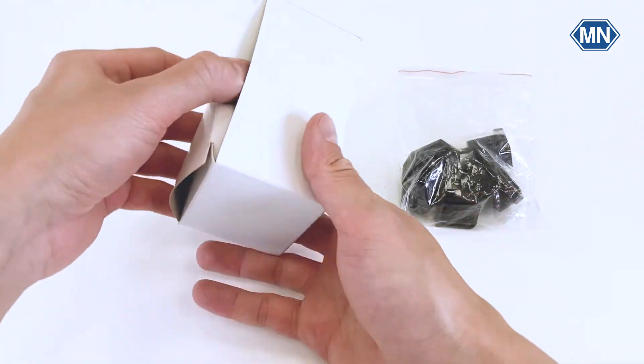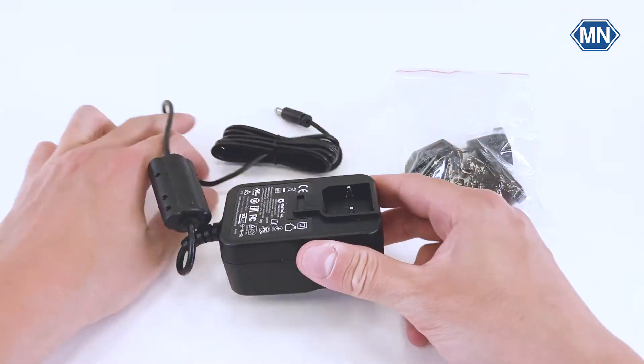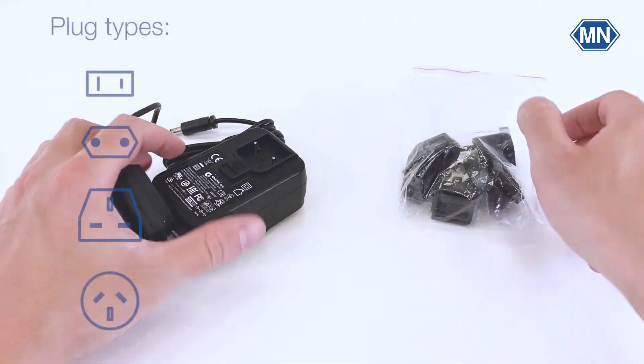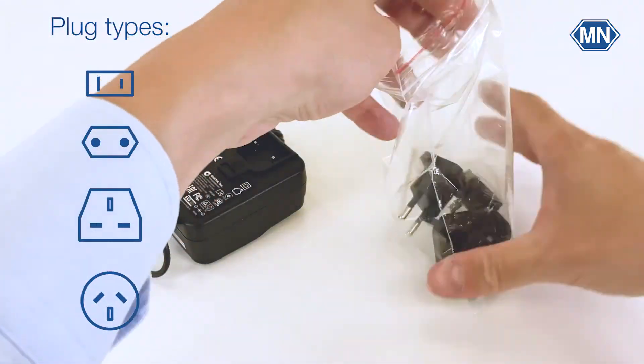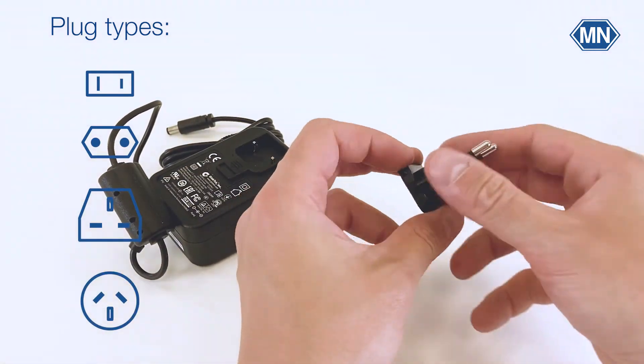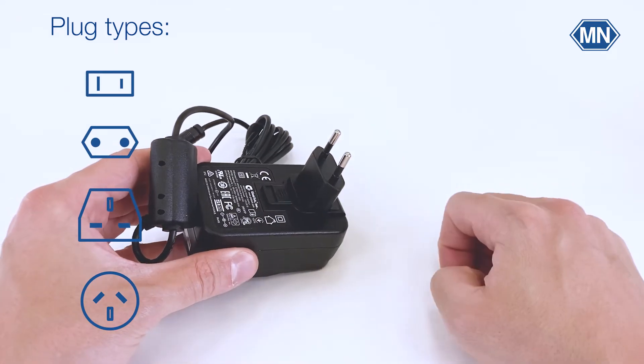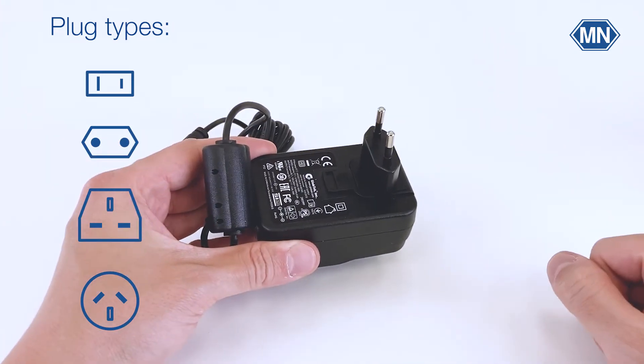The included power supply comes with four adapters for four different power outlets. Before you can use the power supply, take it out of the box and choose one of the four adapters that came with the reflection photometer. Choose the type that corresponds to your power outlet, for example in your lab, and slide it in like this. And once you hear a click, it's ready to use.